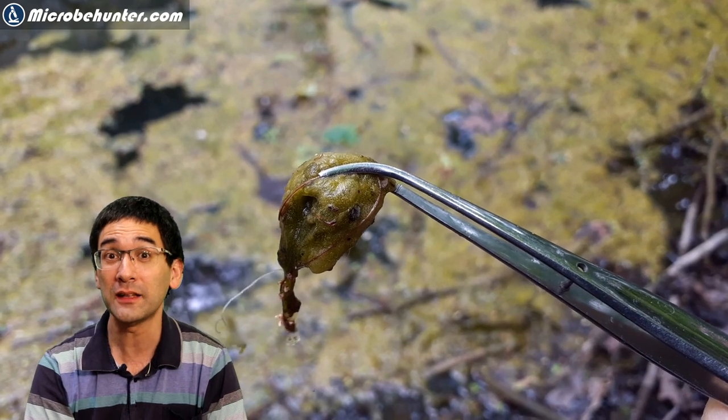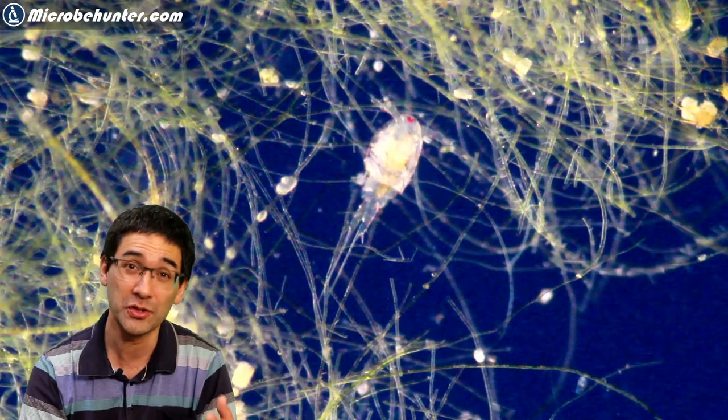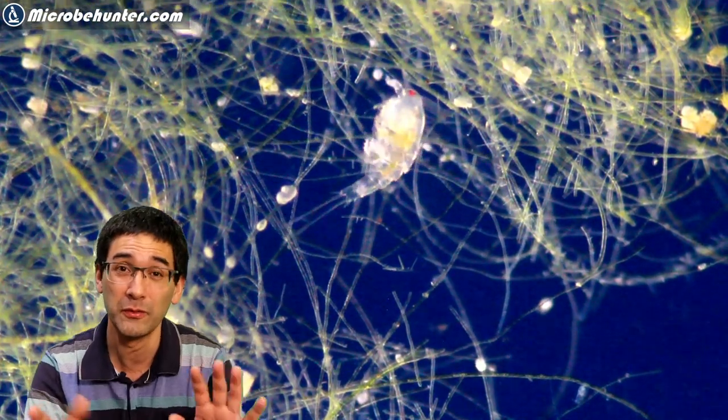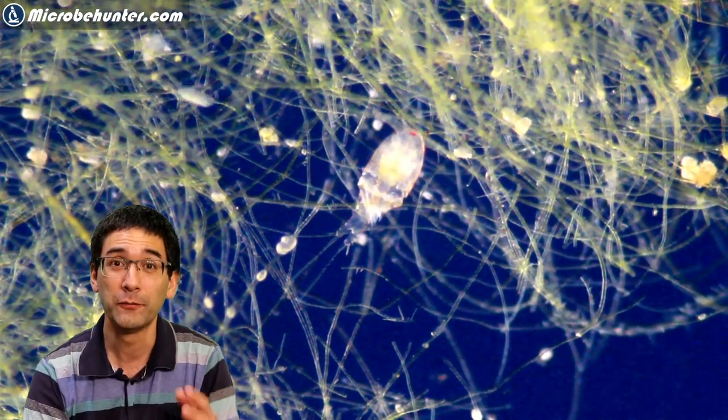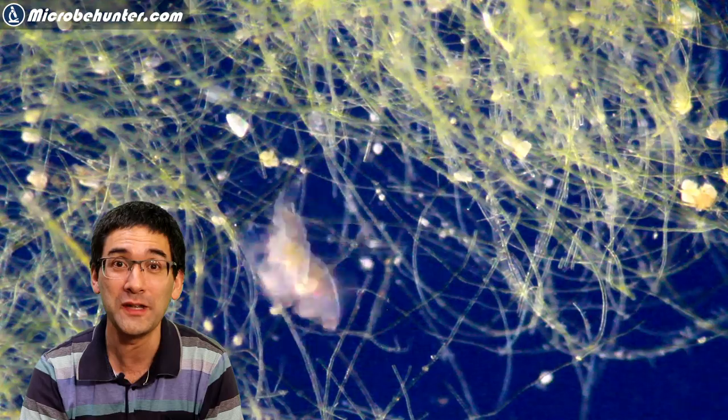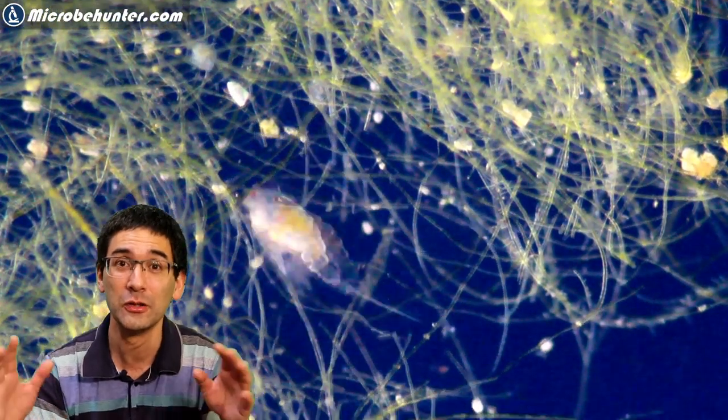I don't like touching these algae myself because they might cause allergic reactions—some of them are not so good. But for copepods and water fleas, they love this stuff because there's lots of food there.